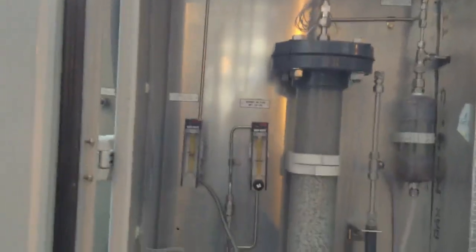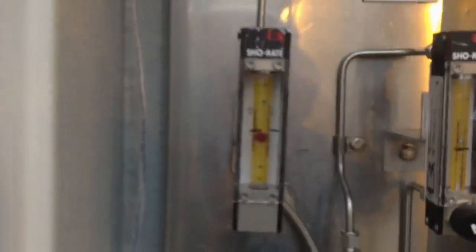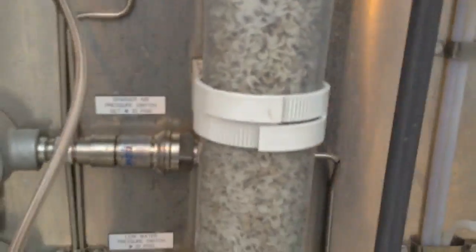Okay, so we have a constant flow of water, and we have a constant airflow, and we are filling up our sparger, and you see bubbles, and you sparge it, and there's water coming in, there's our back pressure coming over, and then we have our wet leg overflow.